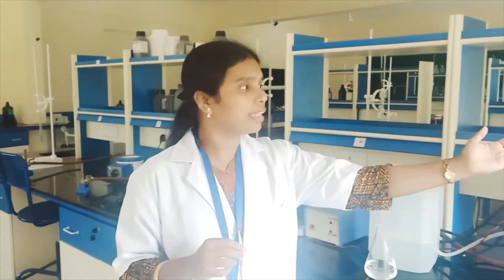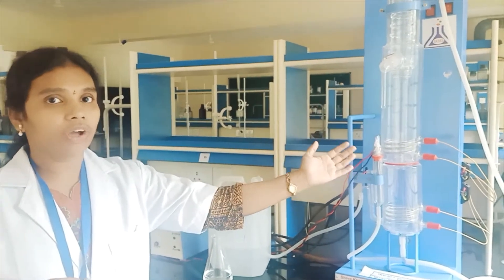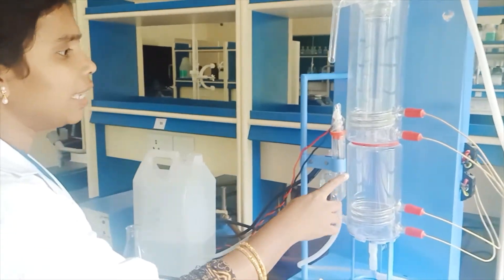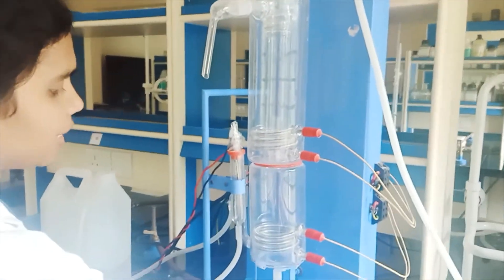So how do we distill this? You can see the apparatus here — it is called a double distillation unit. In this equipment, you can see there are two tubes here.